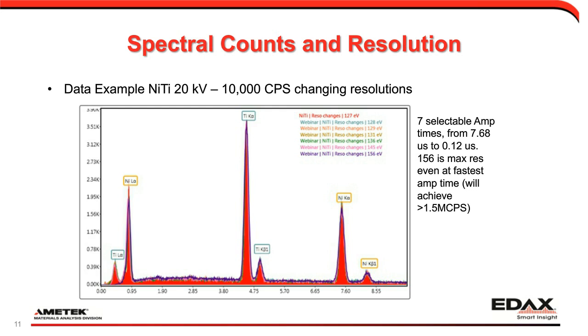We also have a table in the periodic table window where you can select exactly which lines you want to use for quantification. So it's not like you're stuck with one line. There's the option to change them from the user. Generally, we recommend higher energy lines for quantification because there's less overlaps and better signal to background ratio.